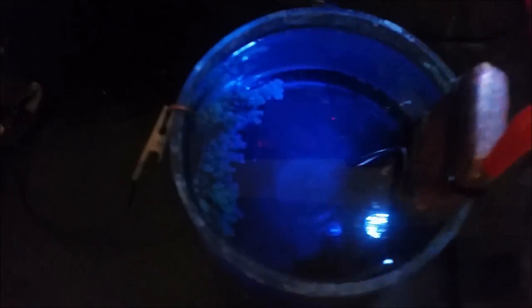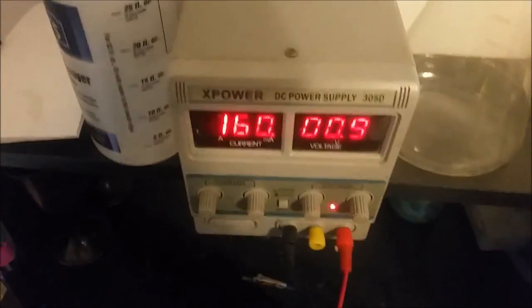We are right around the three-week mark now, and you can see there's quite a bit more growth going on, as well as the power consumption increase. I dropped the voltage a little bit more and the current is still going up, which means that's because of the increased surface area of the cathode.